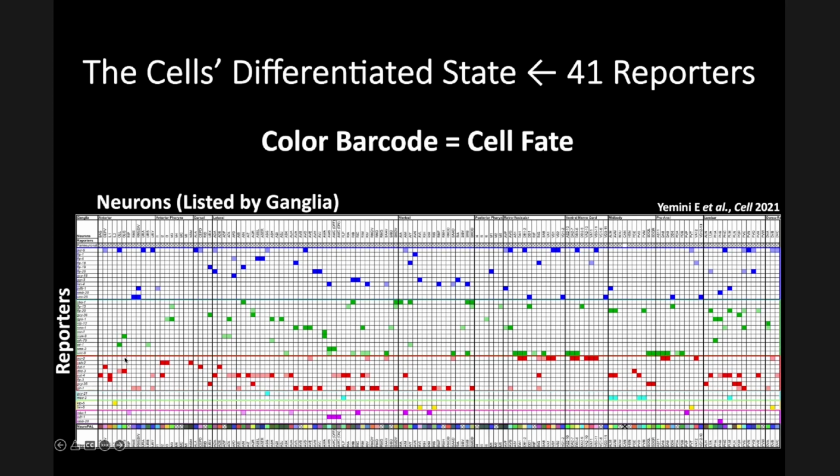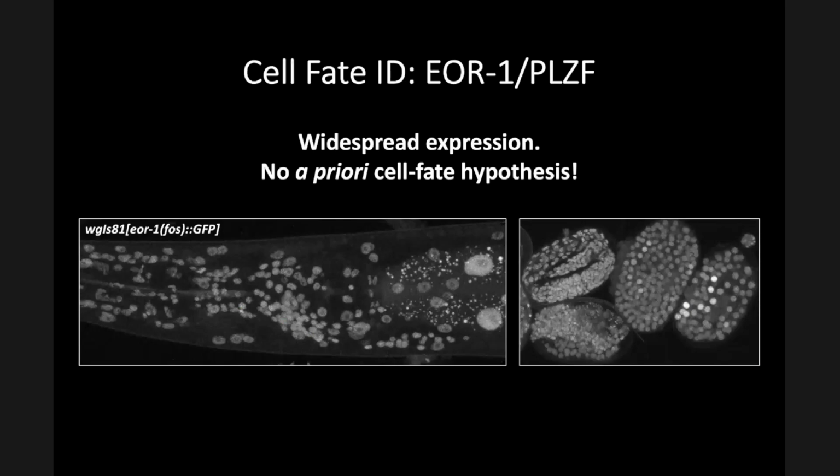And so we can use the coloring as a live visualization of cell fate to see what effect particular transcription factors or other environmental manipulations basically have on the cell fate of particular neurons. So I'm going to take you through that. That's probably a mouthful, probably a little bit confusing, but it all makes sense in a second.